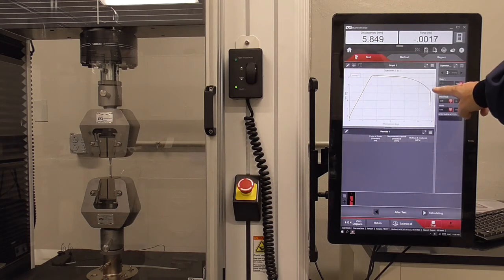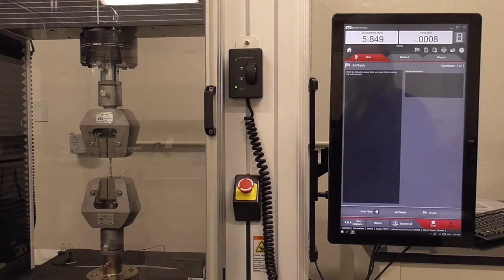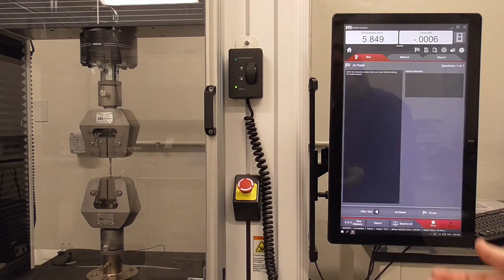The method detected that the force changed drastically and the machine stopped. At this point, continue on in the method — it'll do calculations. Before hitting finish, take the dog bone out to make sure a return of the grips won't crash the elongated dog bone pieces together. We need to get the dog bone out of the machine.